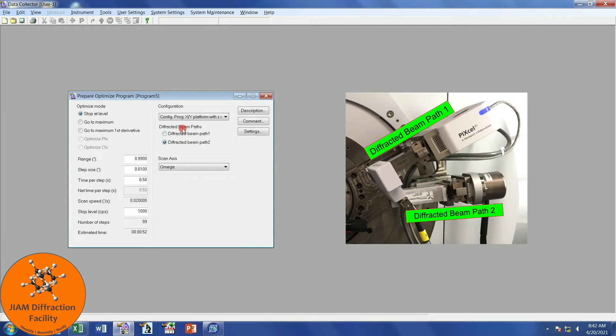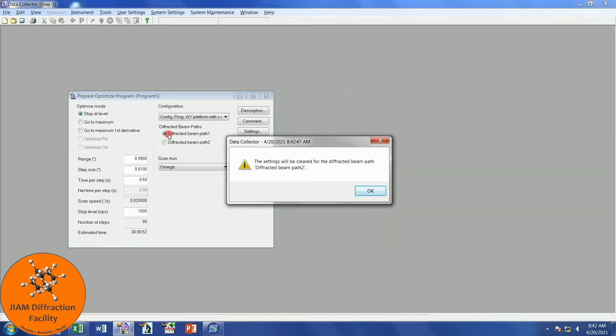Diffracted beam path. I'm going to be performing powder diffraction, or a theta-to-theta scan, using the pixel detector. So that will be diffracted beam path 1. This says that settings will be cleared again, but that's okay.